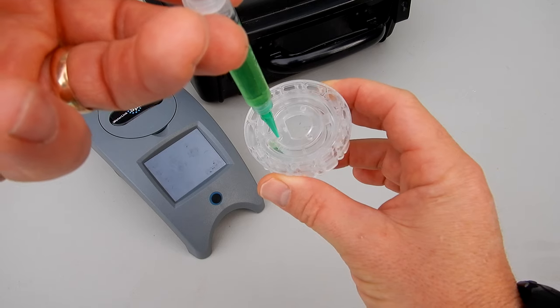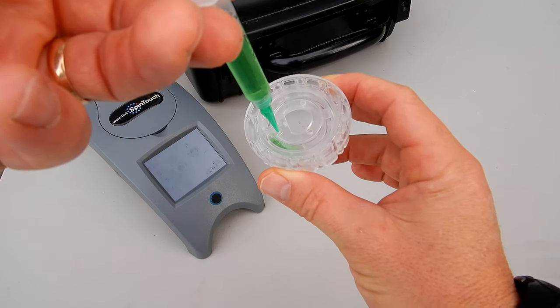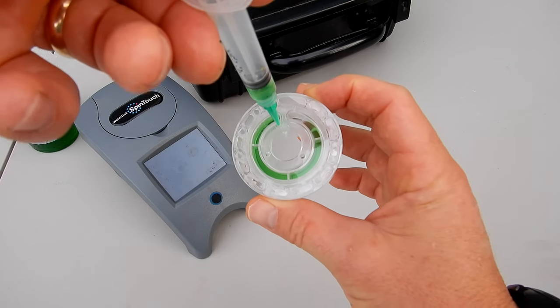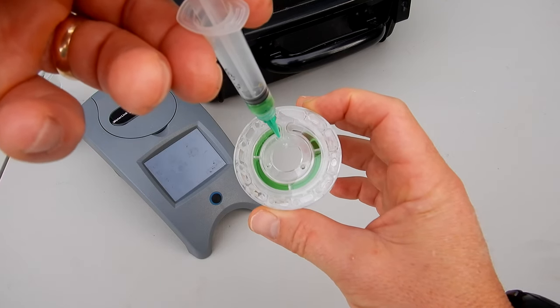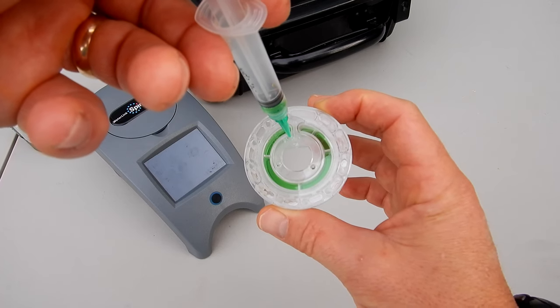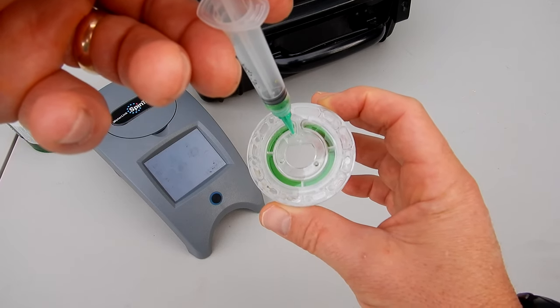One thing to note: it's better to overfill the disc than to underfill it. If you were to stop before the fill line you would definitely get a false reading, so it's better to go further if you're unsure. Past the fill line you're still going to get an accurate reading even if you overfill the disc.